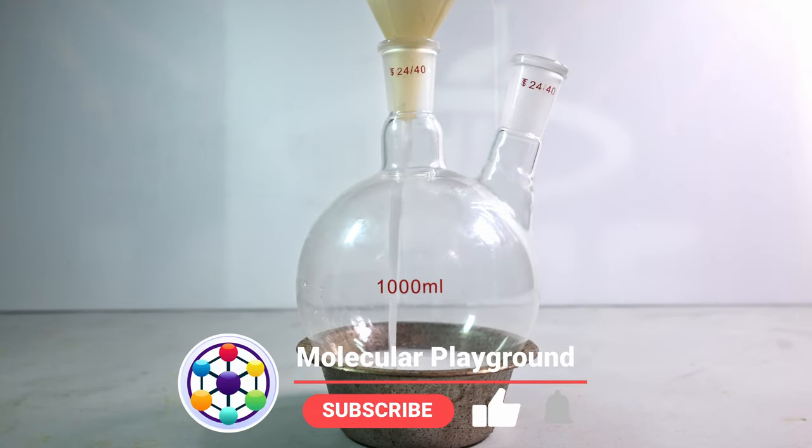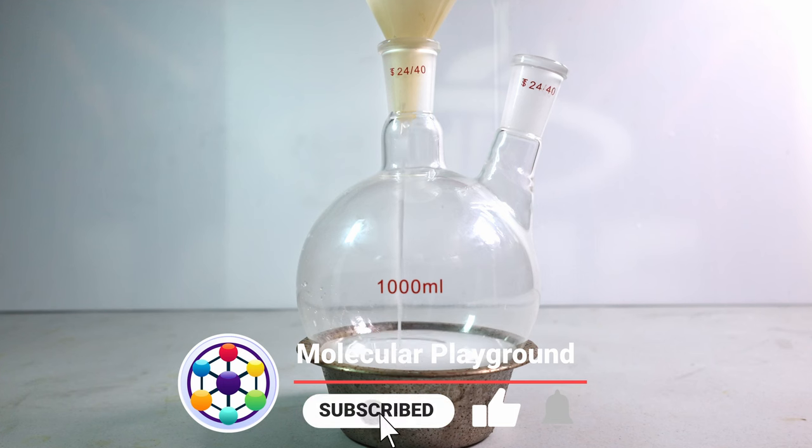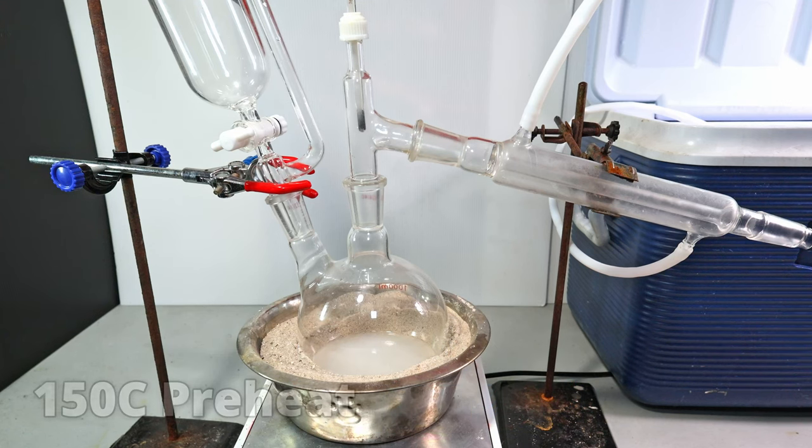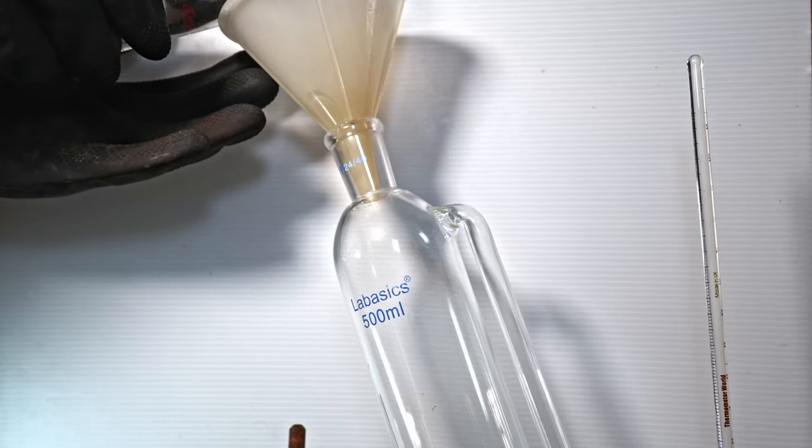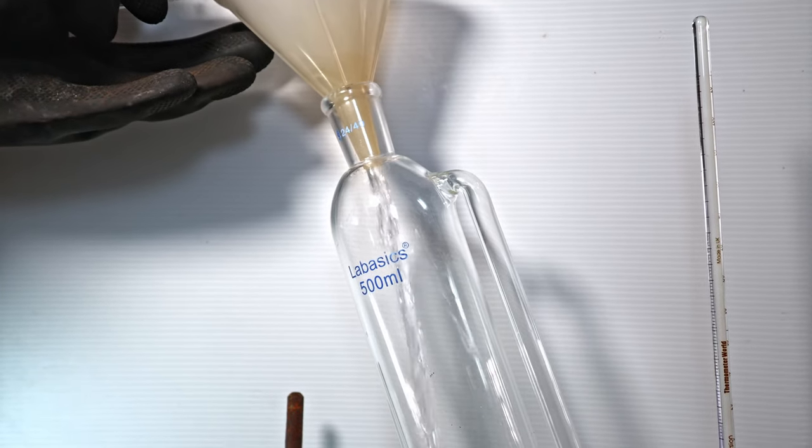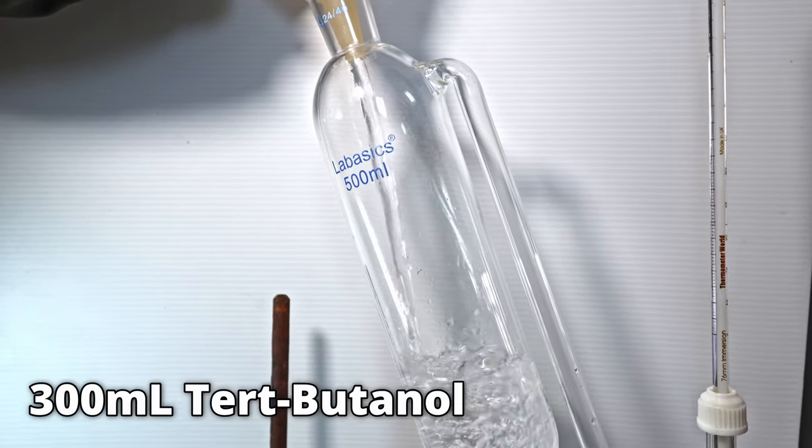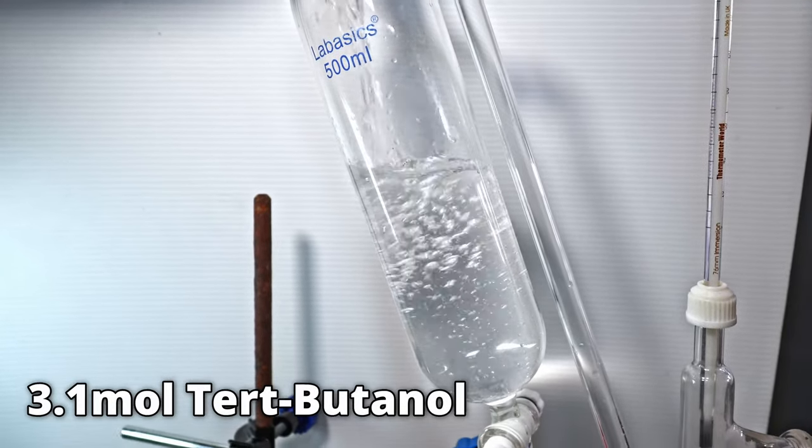I'm going to add this to a two-necked flask. Before I add in the tert-butanol, I'm going to heat the acid up to 150 C. In an addition funnel, I'm going to add an initial 300 milliliters of tert-butanol. That is roughly 3.1 moles of tert-butanol.